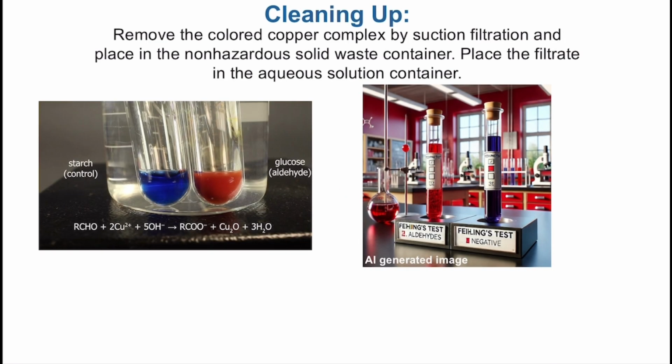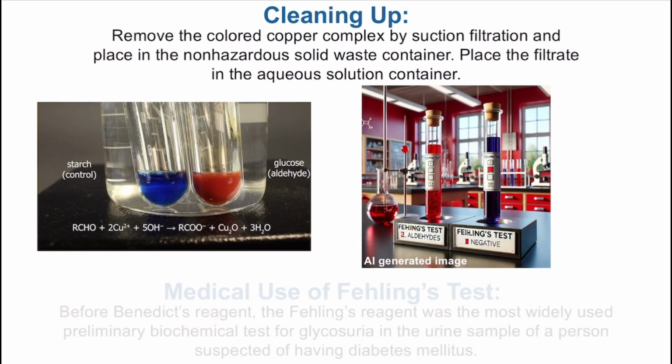To clean up, remove the precipitate by suction filtration, place the solid in the non-hazardous solid waste container, and discard the filtrate in the aqueous solution container.